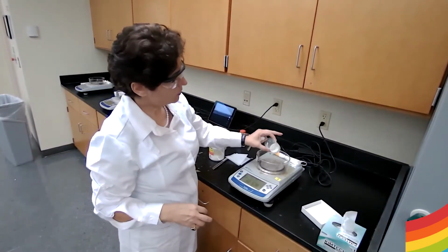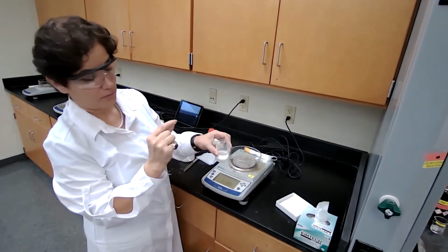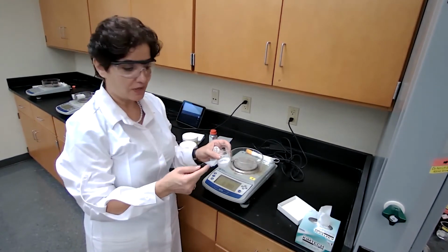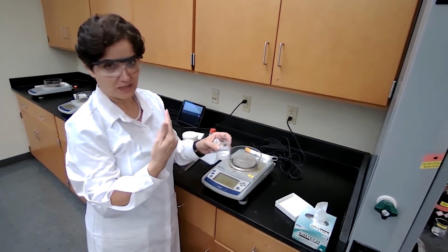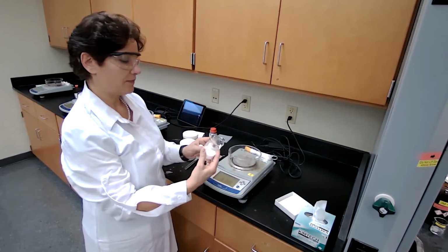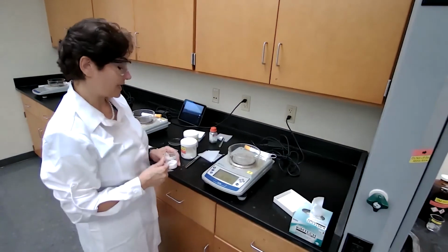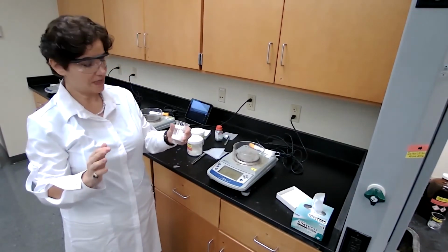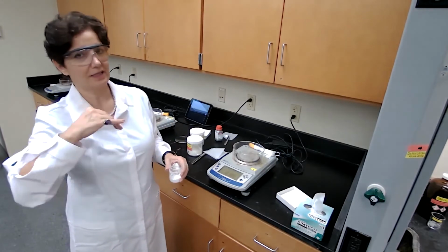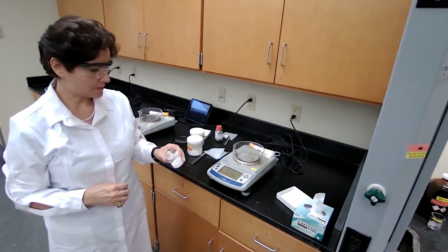Next step would be to prepare our sample and measure the melting point of the sample. This sample is also going to be saved for the next experiment, which is chromatography. I'm using the sample that we separated today, so I would save it for melting point and for the next experiment. You don't need the chromatography result to write a lab report for this experiment. I'm just saying I'm not getting a new sample, just using this sample for one part of the next experiment.